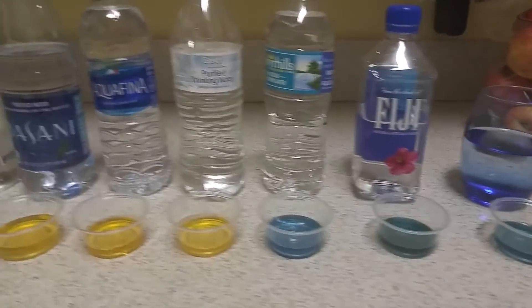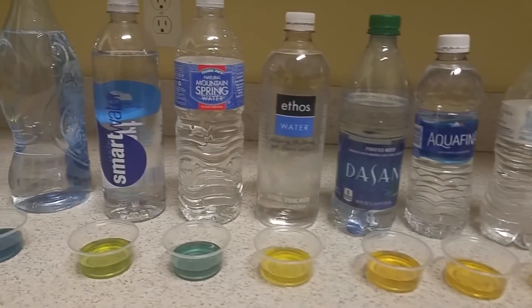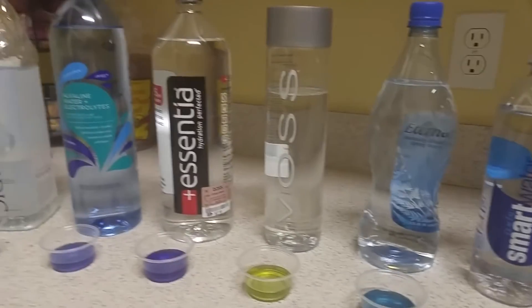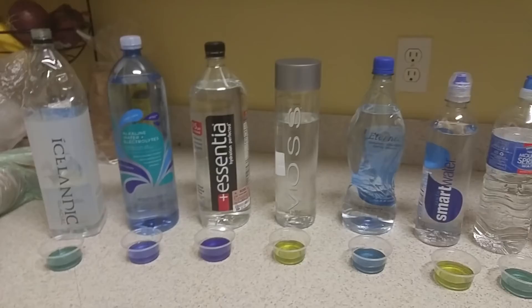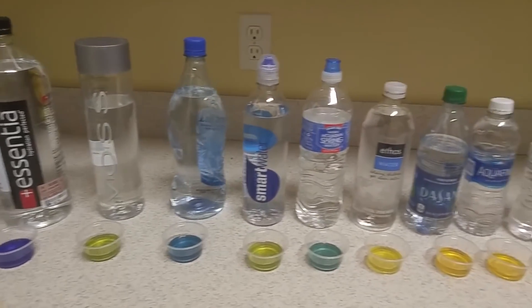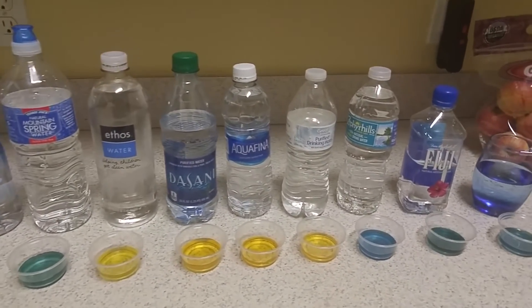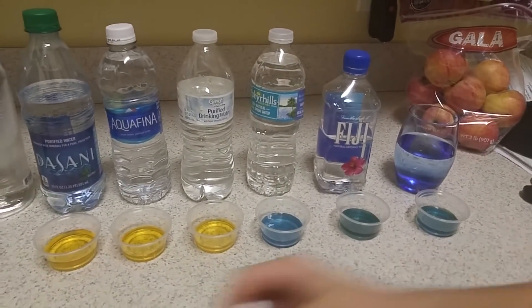Here are the final results. Remember, you don't want to be drinking the yellow ones. The darker the blue, the better. Some of these bottles you don't want to be wasting your money on — you definitely want the Essentia. Also, this does not test fluoride levels or anything of that nature — this is strictly pH level. So you also want to check if there's fluoride in any of these drinking waters.